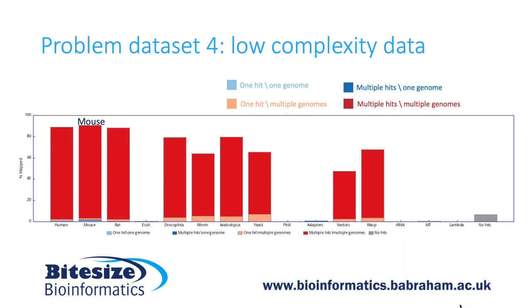At this point, I'd like to briefly mention Millie Thackeray, who was a placement student working at the Babraham Institute, who did this work. So she was the person who was responsible for downloading a large number of mouse RNA-seq datasets and then analysing them with FastQ Screen. We all found it quite a surprise, actually, the number of publicly available datasets, which on closer examination are not quite what you would expect.